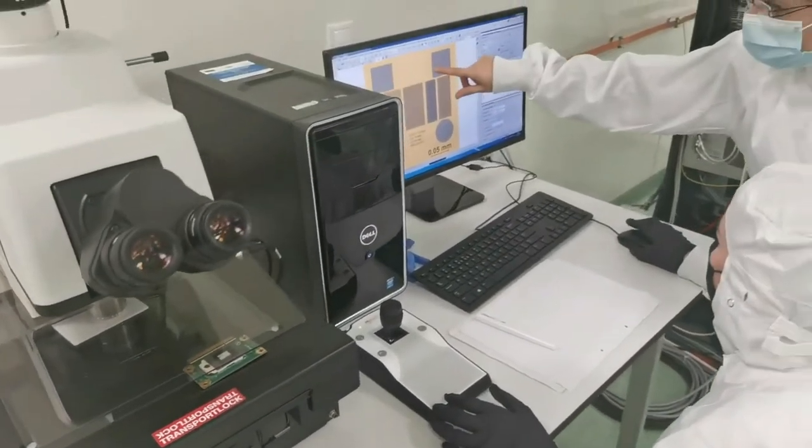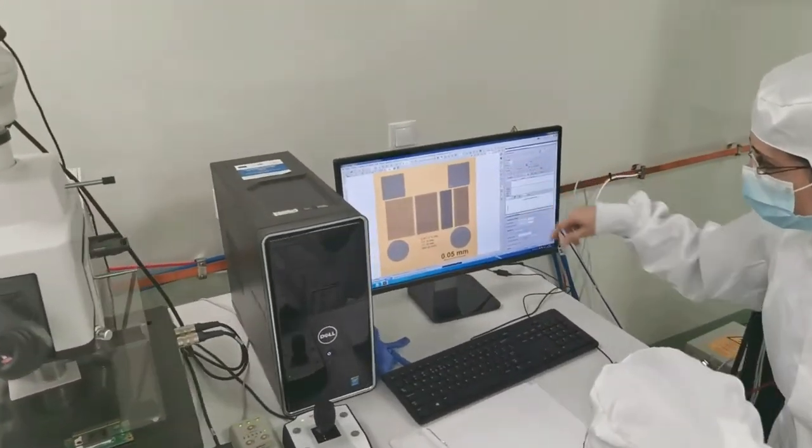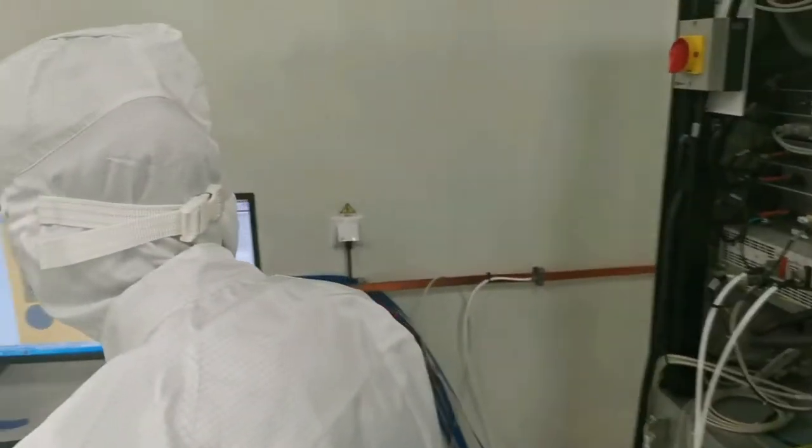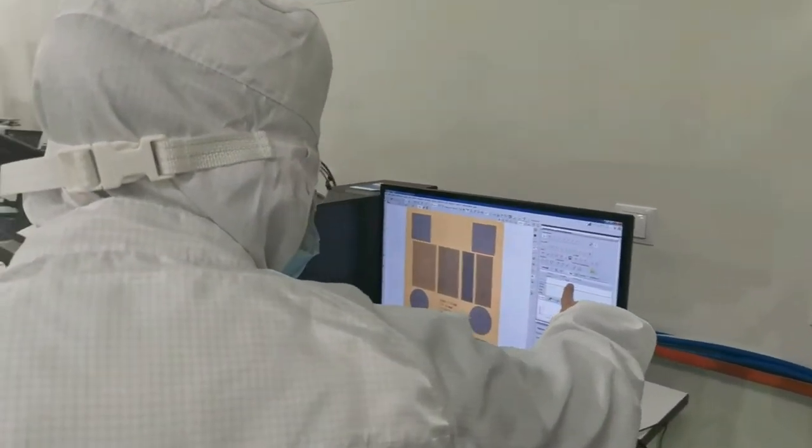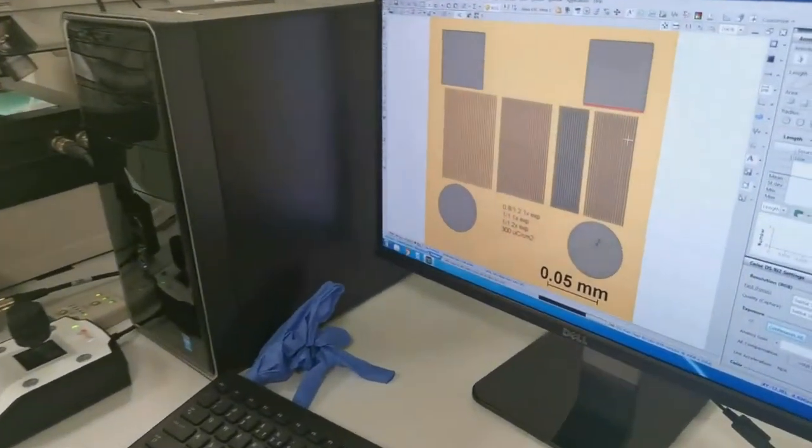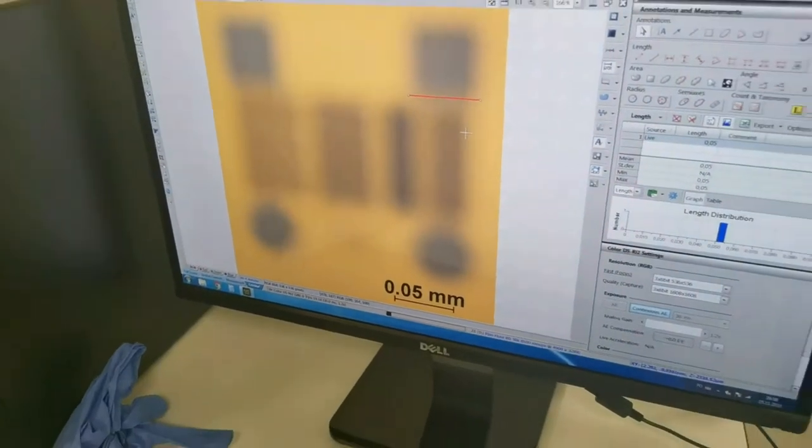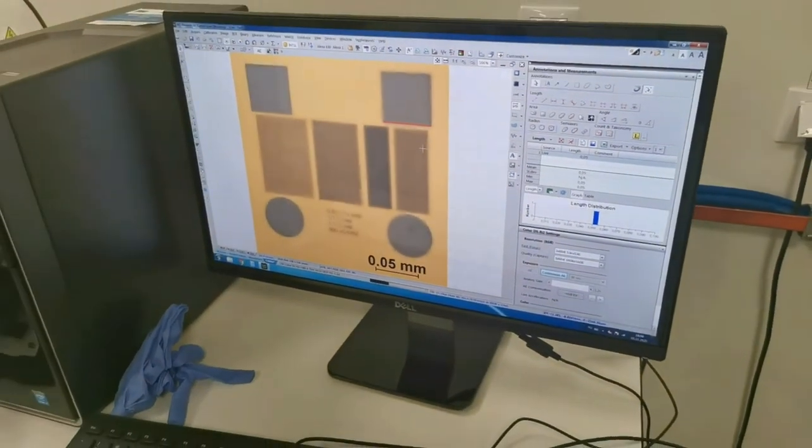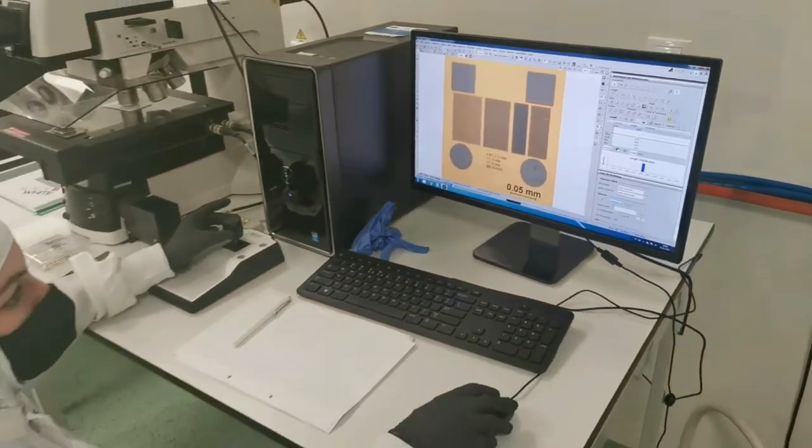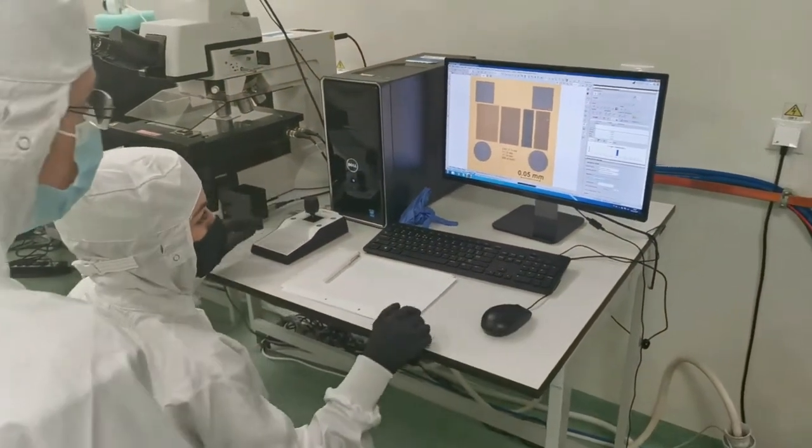The main optical microscope features episcopic bright field and dark field imaging, episcopic differential interference contrast, bright field simplified polarization, as well as diascopic bright field and epifluorescence modes. The microscope is equipped with a motorized sample stage, a halogen lamp, a CCD camera, and several magnification objectives.